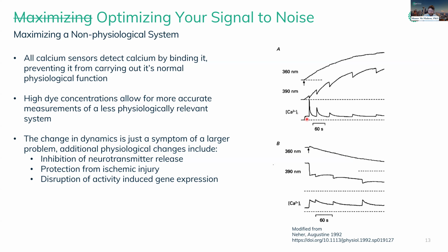We can see at first the calcium transients are very large and fast, but as the dye enters the cell, the transients get smaller and slower. Afterwards, he repatched the cell with a pipette without dye so that the dye was removed from the cell by the pipette. And we can see as the dye is removed, the calcium signals recover, becoming larger and faster.